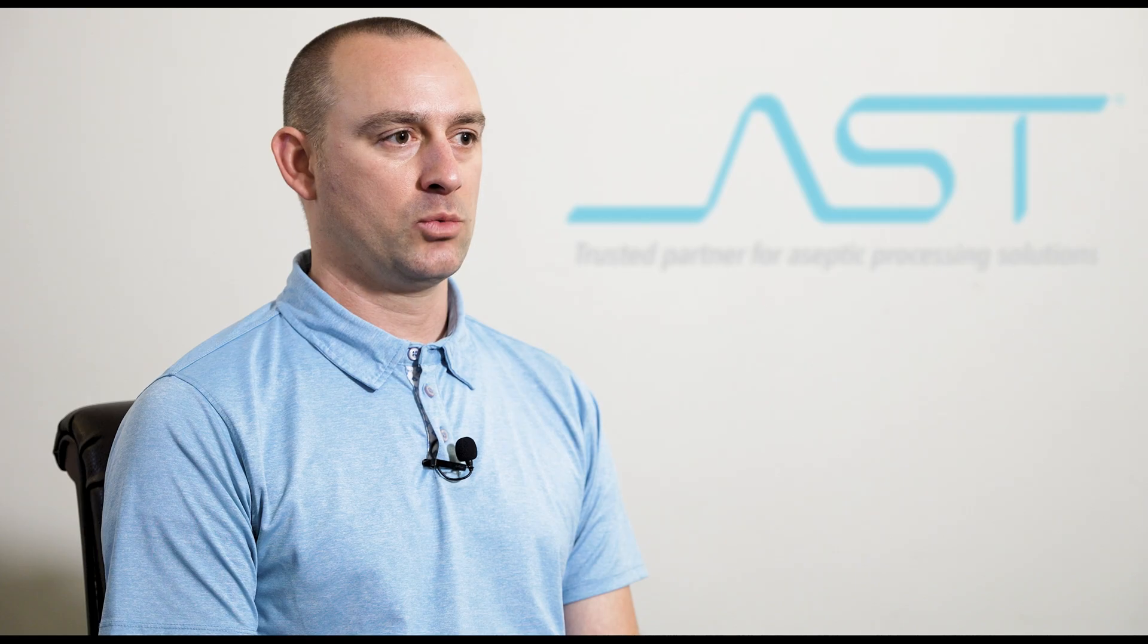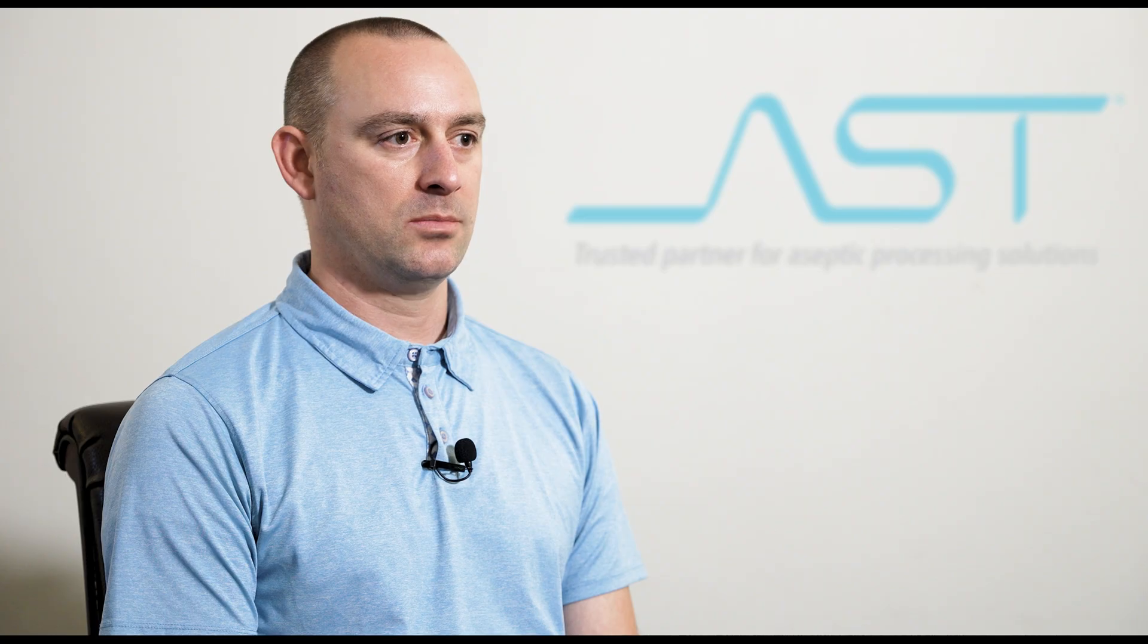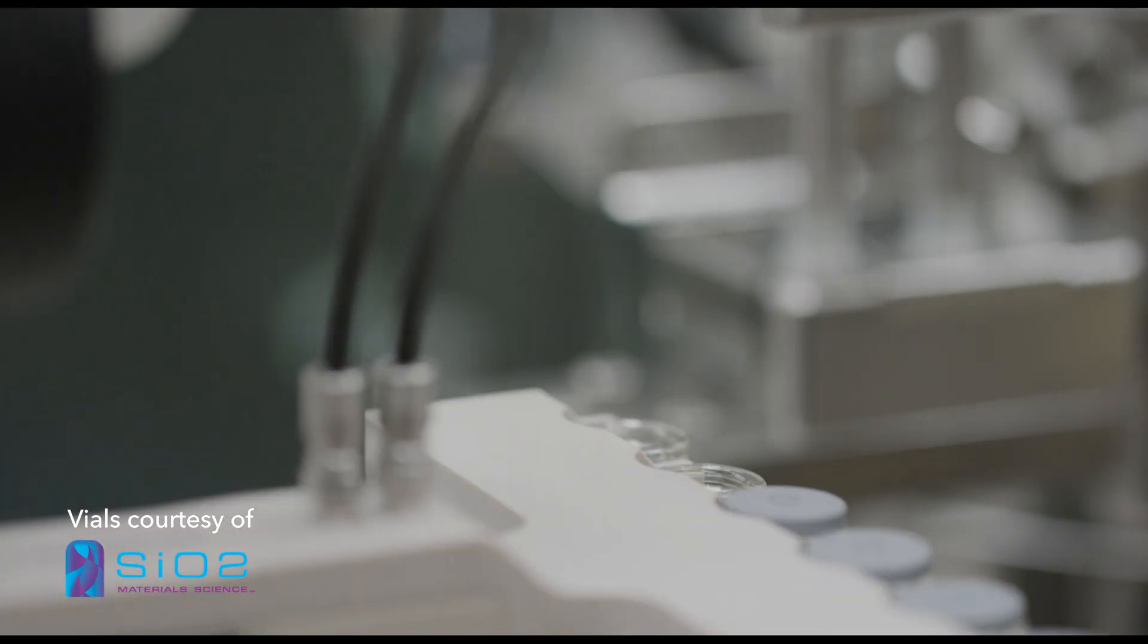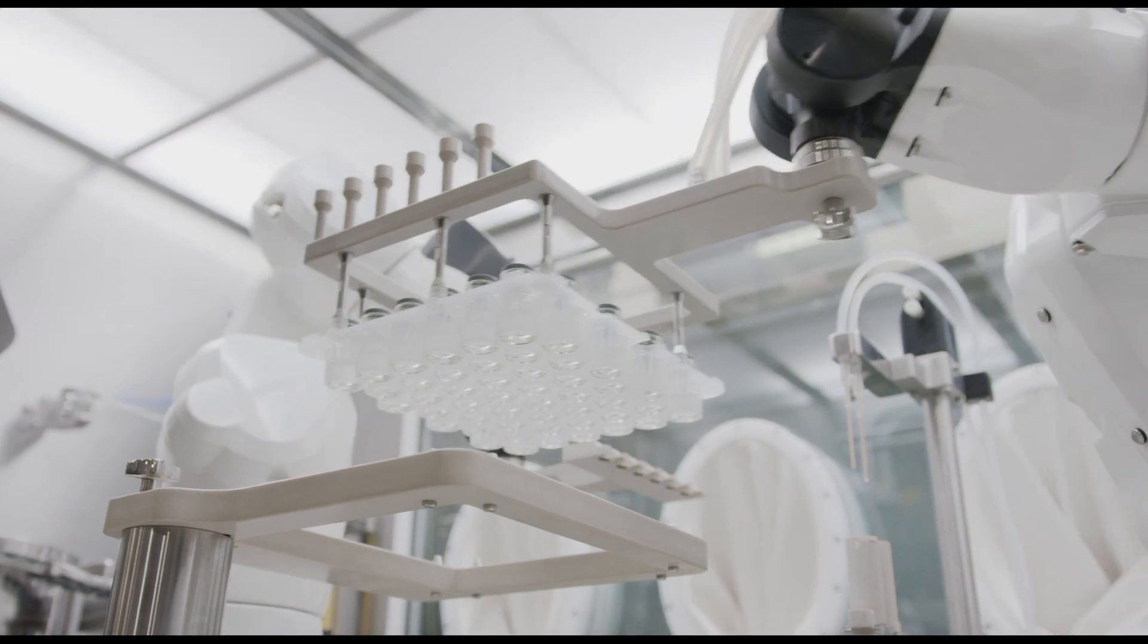They needed to have a suitable reach and weight capacity, as well as the ability to work at high speed. The Staubli robots maintain a clean environment while allowing for fast and consistent processes. Many times they allow us to save space in the machines.